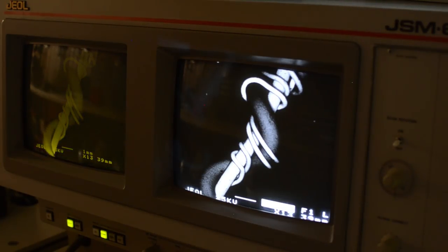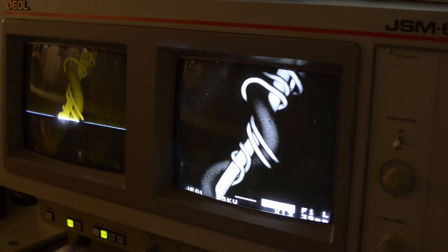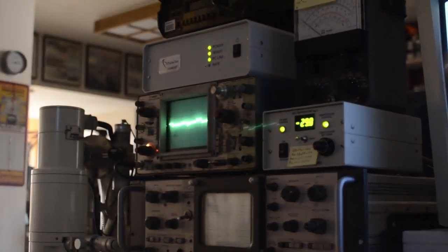Alright, so here's our sample. Right now we're looking at backscattered electrons, and these are the different wires that are all wrapped around each other. If I take a look at the output from the preamplifier on my scope, the triggering's kind of going crazy. Each time these stair steps or sawtooth patterns kind of reach the top, then that FET is shorted out and we drop back down to the bottom. Each step on here is a discrete X-ray event. It's pretty neat we can actually see that.